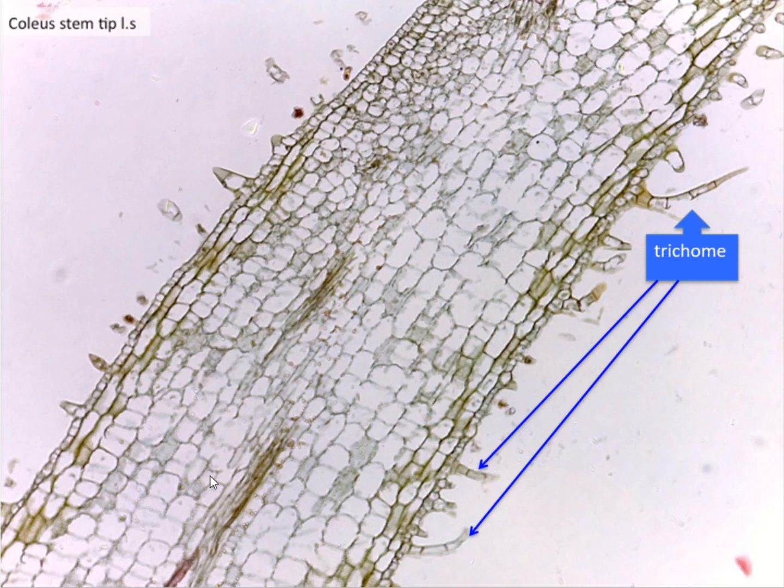Next, we have a different picture of the Coleus stem tip, this time showing what are called the trichomes. You can think of the trichomes as small hair-like protrusions from the epidermal layer, the outermost layer of the plant cells, that grow out to aid in water and nutrient absorption for the plants. It allows the plant to communicate with its extracellular environment in order to acquire the nutrients needed to survive.